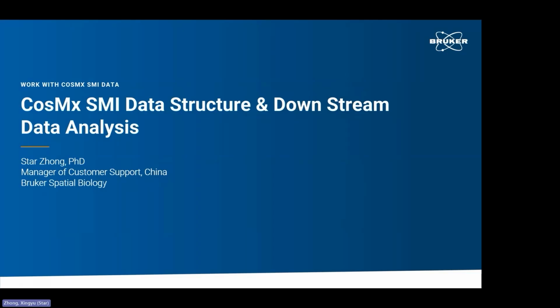In this advanced session, we will cover the CosMx SMI RNA data structure and a little bit of the downstream data analysis, running the pipeline in AtoMx and visualization out of AtoMx.